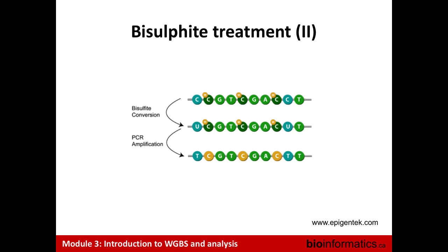Do you see a single mismatch? Yeah, I don't even know, but I suspect that they just assume fully methylated or unmethylated in this case, and it's probably a ratio between those two. I'm not following the technology closely, because I think myself, actually, it can convert these even if they're hydroxy. So I don't know whether, if you're looking at a particular CpG, you can say it's fully methylated or unmethylated, or if it's 50%.